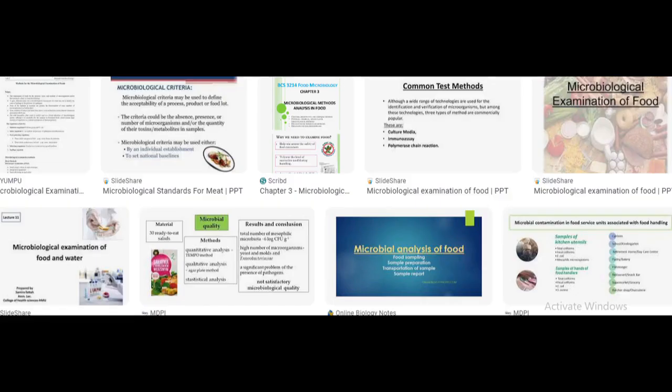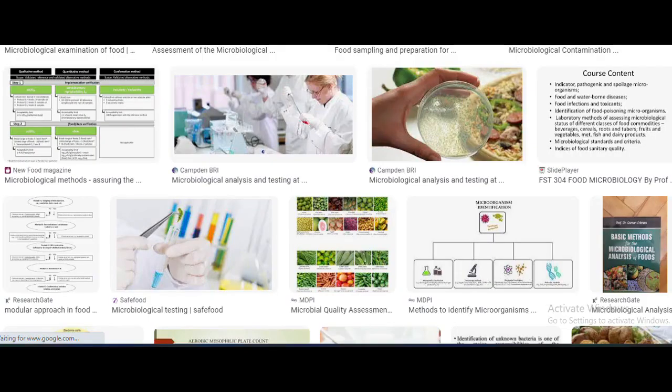The method is usually based on inoculating replicate tubes of an appropriate liquid medium, usually 3, 4, or 5, with 3 different sample sizes or dilutions of the material to be studied, e.g., 10 gram, 1 gram, 0.1 gram. The medium used has to be designed to make it possible to decide whether growth or no growth has occurred, and the number of positives at each sample size or dilution is determined after incubating the tubes.